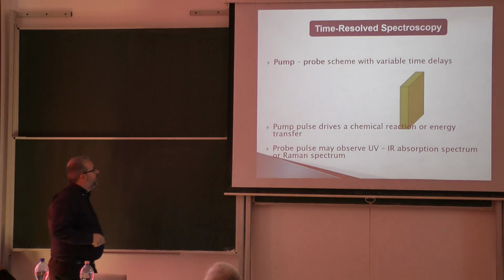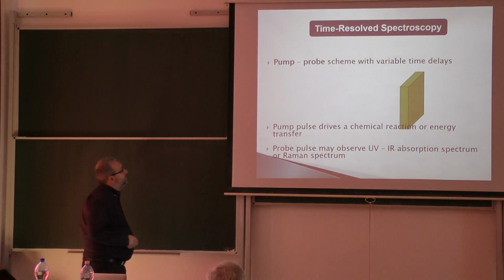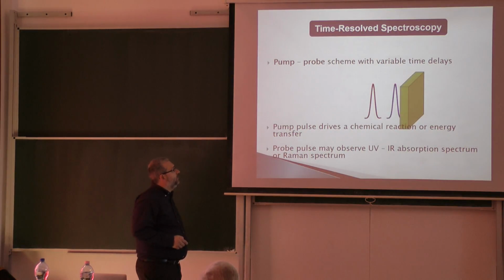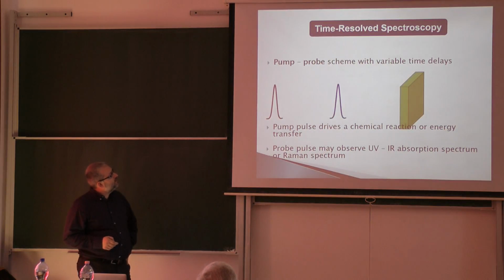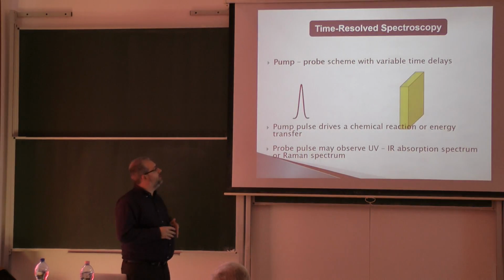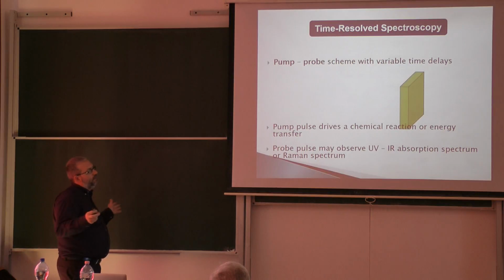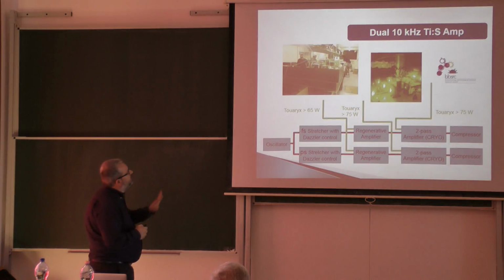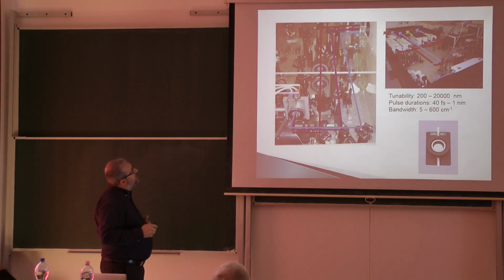Now the idea, it's also pump probe, it's very easy. We are pumping with a blue beam, and you can see that the blue beam is the first one. This is the excitation, and basically what we are doing is increasing the time between the blue and the red beam. So we are probing at different time delays, and we are measuring either absorption spectrum or Raman spectrum, depending on the situation. These are details that we don't need to know. This is how it looks like actually. At the end, this is our sample holder.